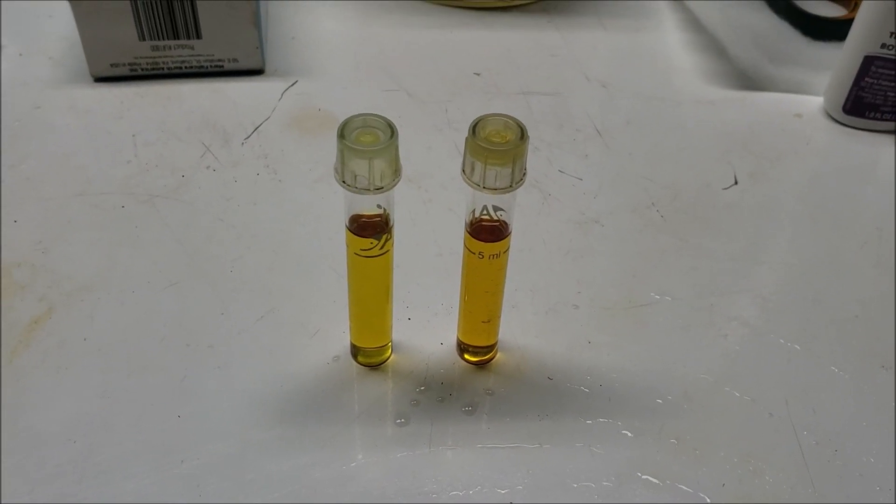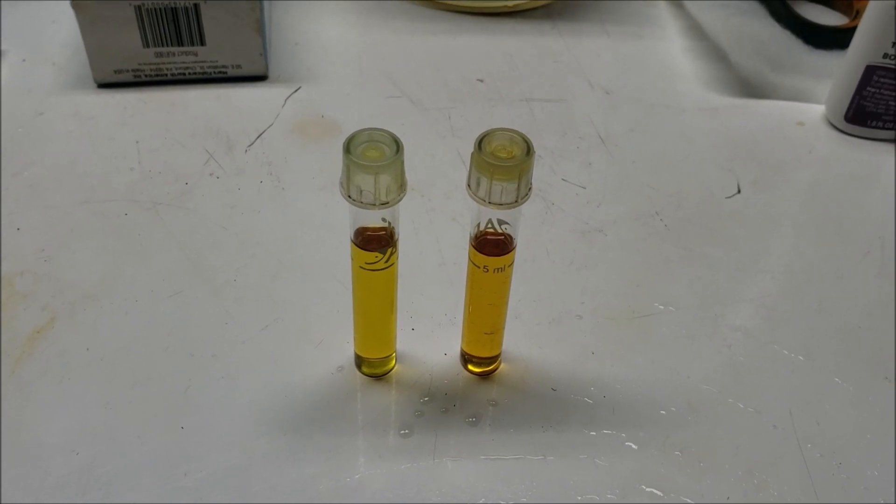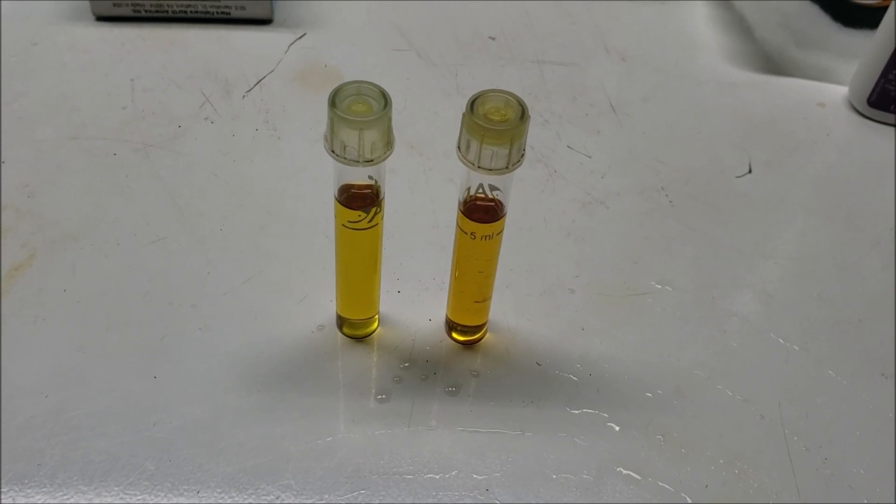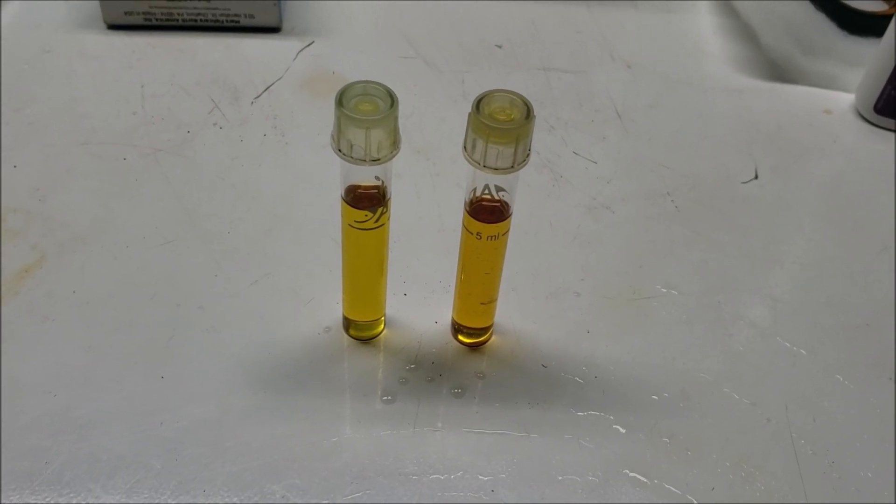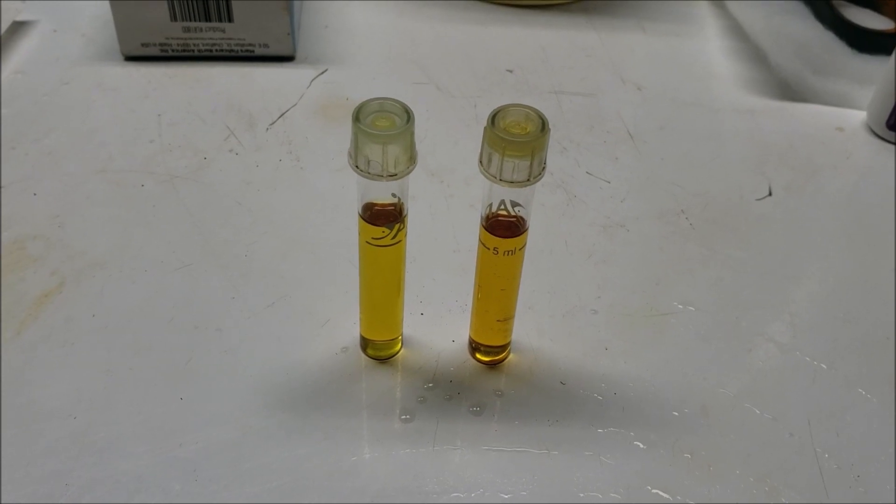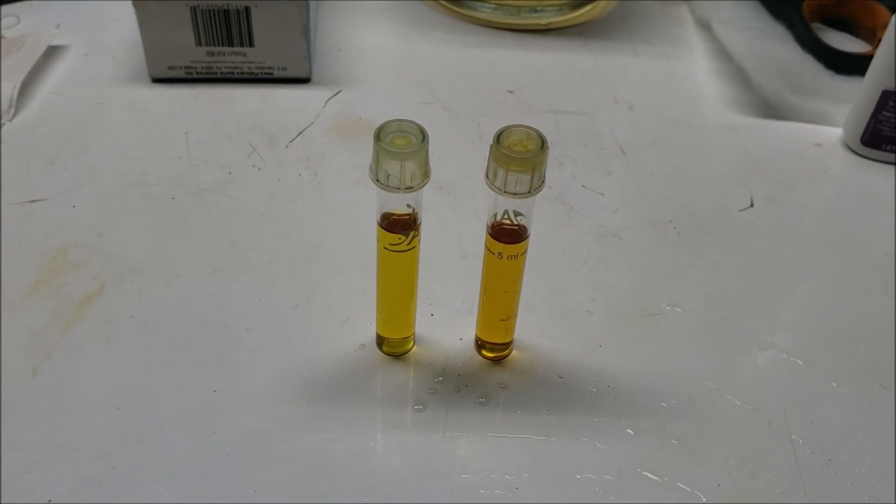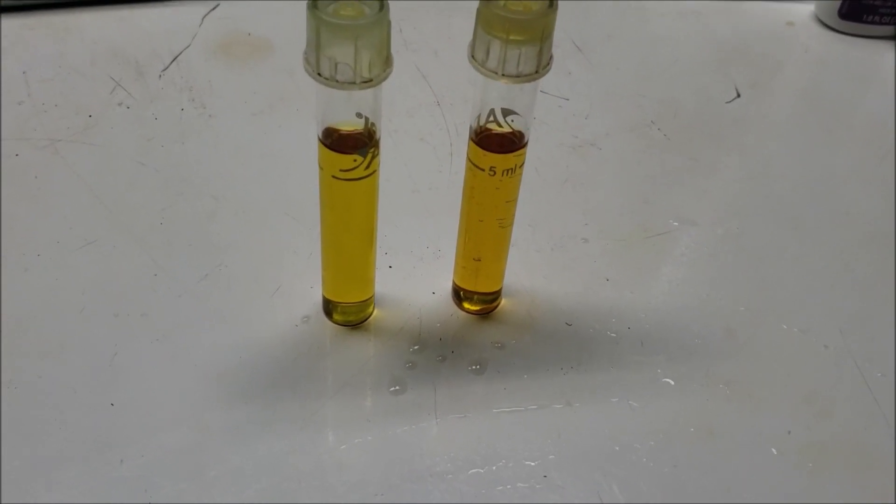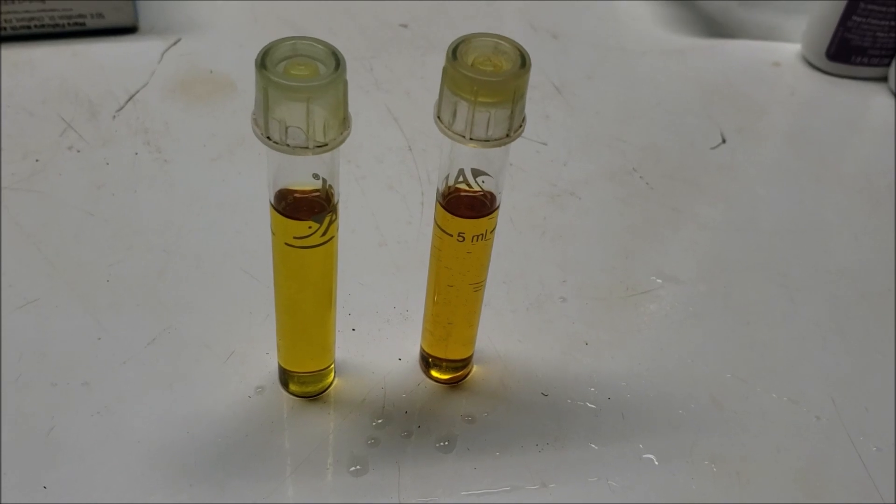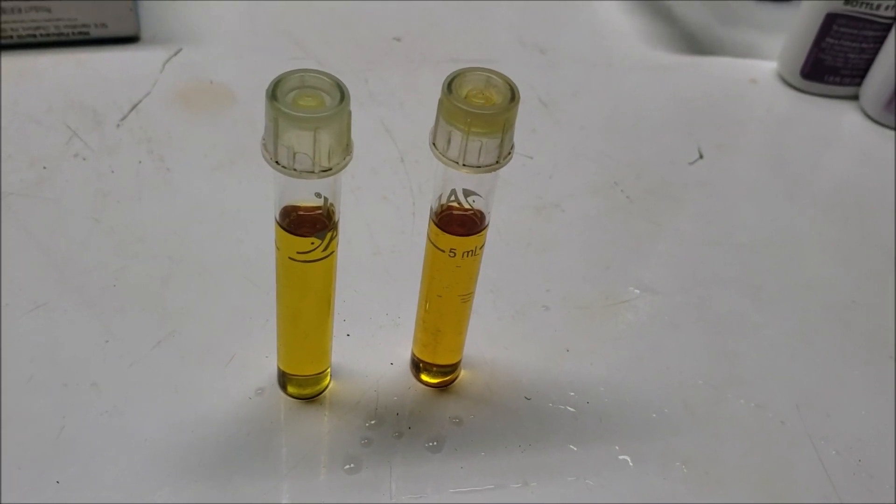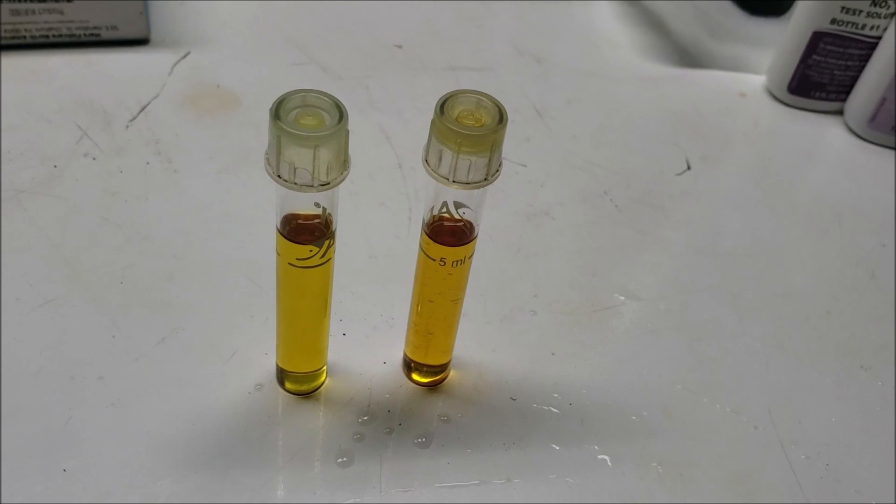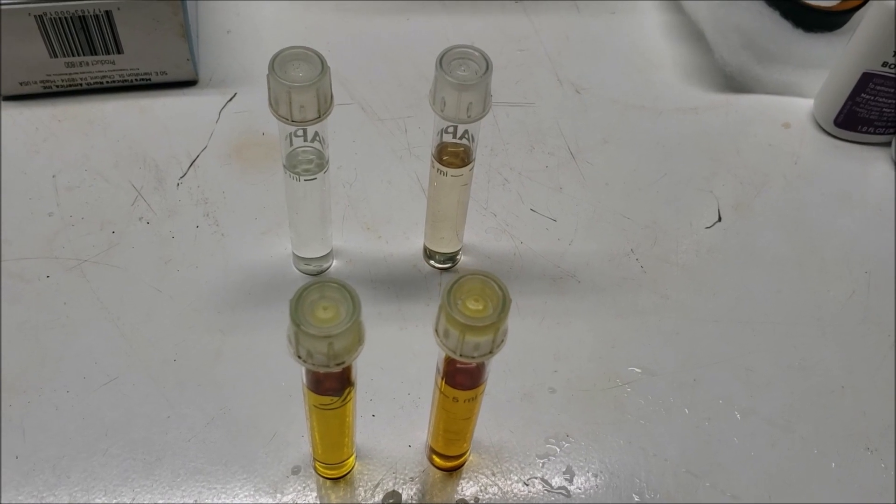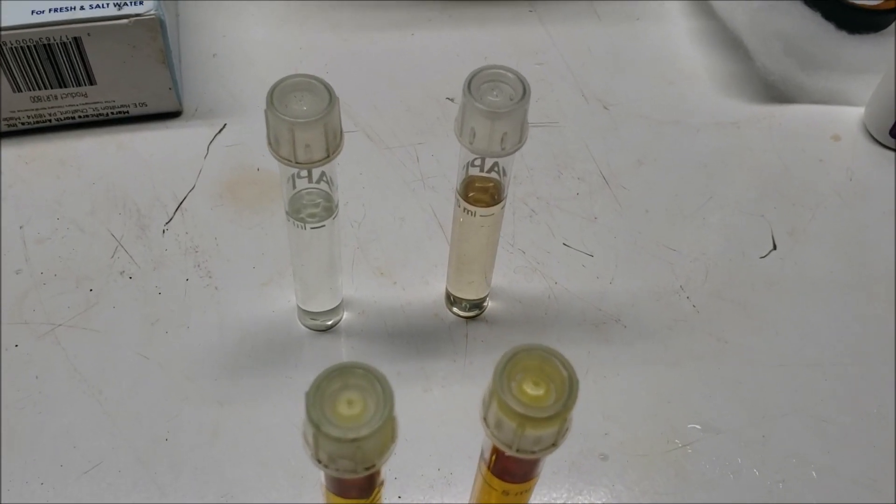All right, now I'm going to let my imagination go wild and say the right one looks a tiny little bit darker than the one on the left there. But I suspect that's only because I know that's the one that has the tannin stained water in it to start with. Again, I don't know. To me they look pretty much the same and that's about what I was expecting. That's not really that unexpected of a result. I wasn't expecting a massive color change. And I will show you why. If you look at the starting vials without any reagent in it, there's not that dramatic of a color difference to begin with.